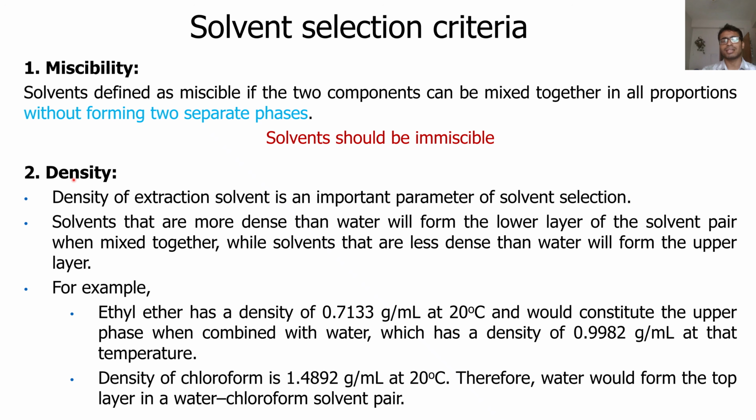Actually, density may differ solvent by solvent, so just keep this into consideration. Okay, because we usually don't use solvents which are having the same density because it will create some interferences. Okay, so it's better to use solvents which are having a greater difference in their density.